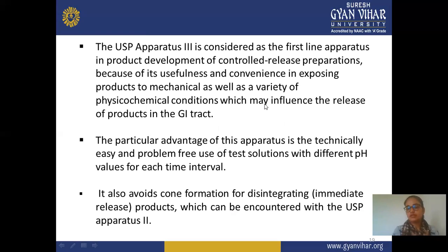Some physical and chemical conditions may affect the dissolution rate and the product release in the GI tract. A particular advantage of this apparatus is that it is technically easy and problem-free to use test solutions with a different pH value for each time interval. So the advantages of this apparatus are good, and for controlled release you can easily use it; it won't show much error, and problem-free testing is obtained when you use this type of dissolution.